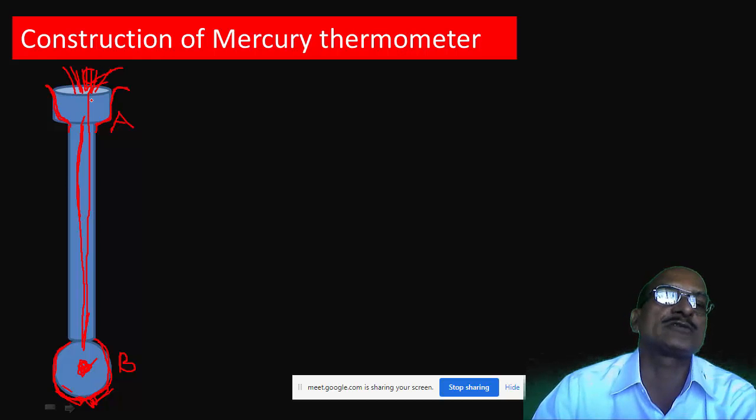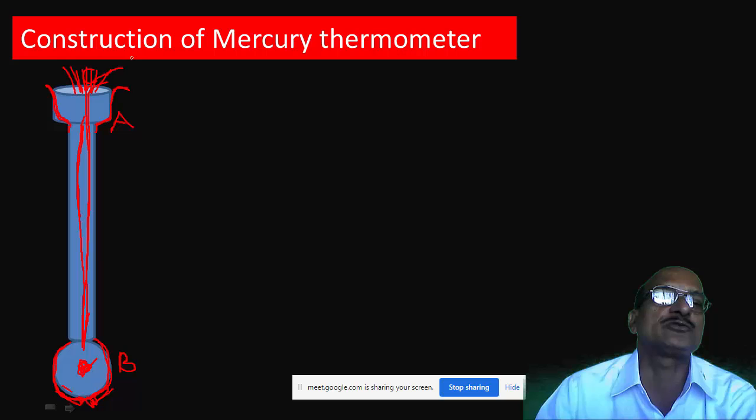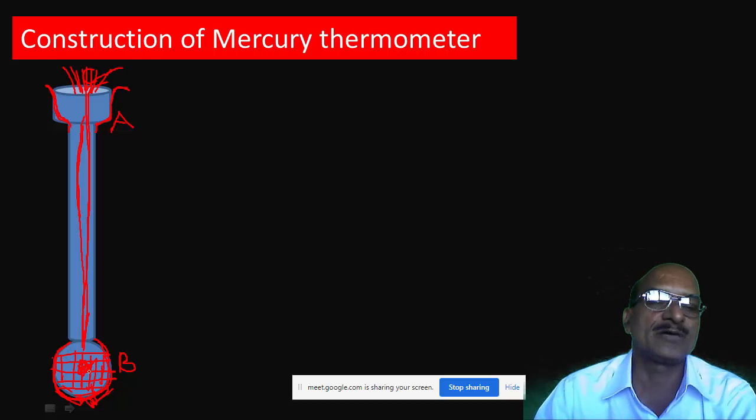When the air goes out, the mercury enters into the capillary tube. In this way, drop by drop, slowly, you have to fill up the bulb with mercury. This bulb is filled with mercury using this procedure — it will not fill immediately. Slowly, you remove the air and then the mercury enters the bulb. Once the bulb is filled with mercury, the tube is kept aside for a period of one week.